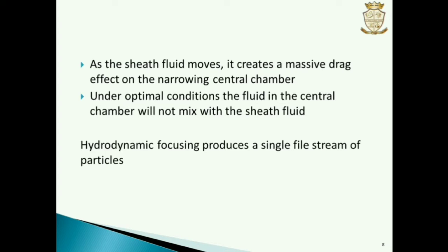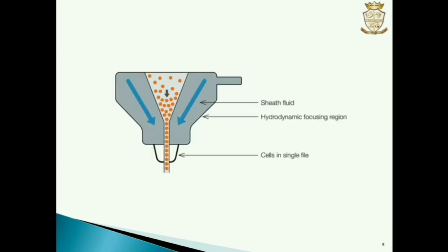Hydrodynamic focusing produces a single file stream of particles. In this diagram, we can see sheath fluid and hydrodynamic focusing region. Here we can see cells in a single file.